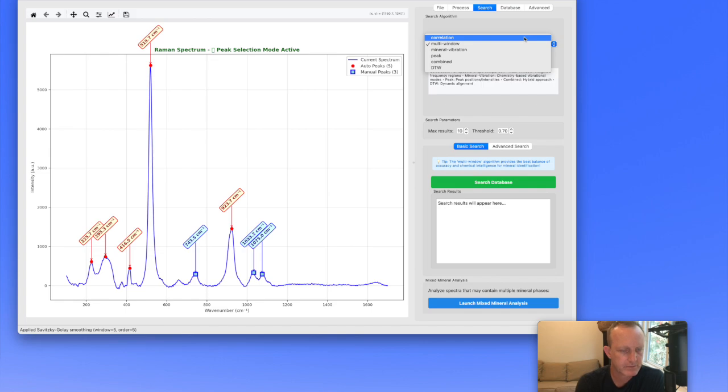The multi-window approach applies a weighting scheme. It breaks up the spectrum into regions: lattice modes, silicates. So the lattice modes would be the lowest, kind of a more bending fingerprint region between 400 and 800 reciprocal wavenumbers, and then from 800 on, we're calling that a different region for silicates. And this is really for mineral specific stuff.